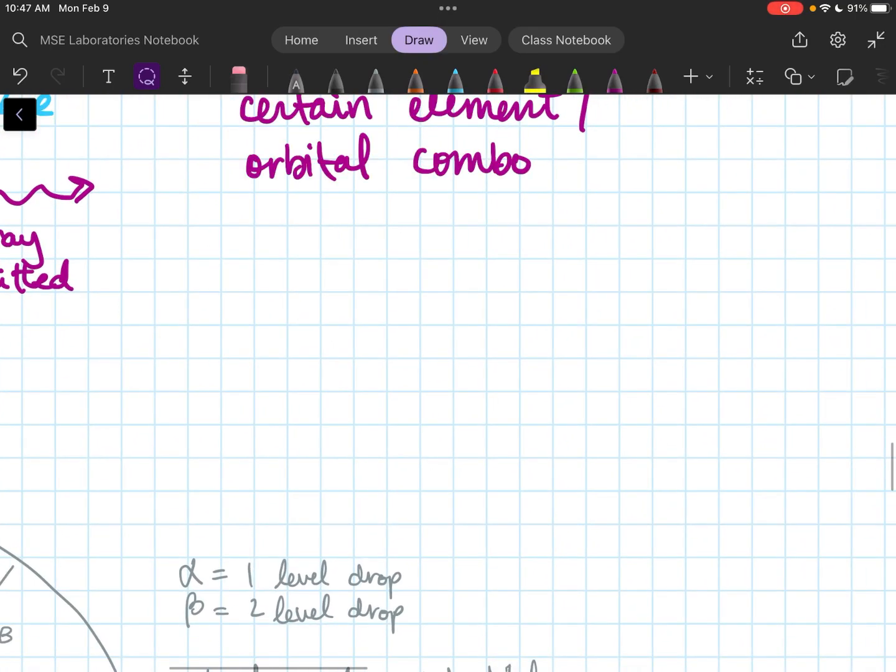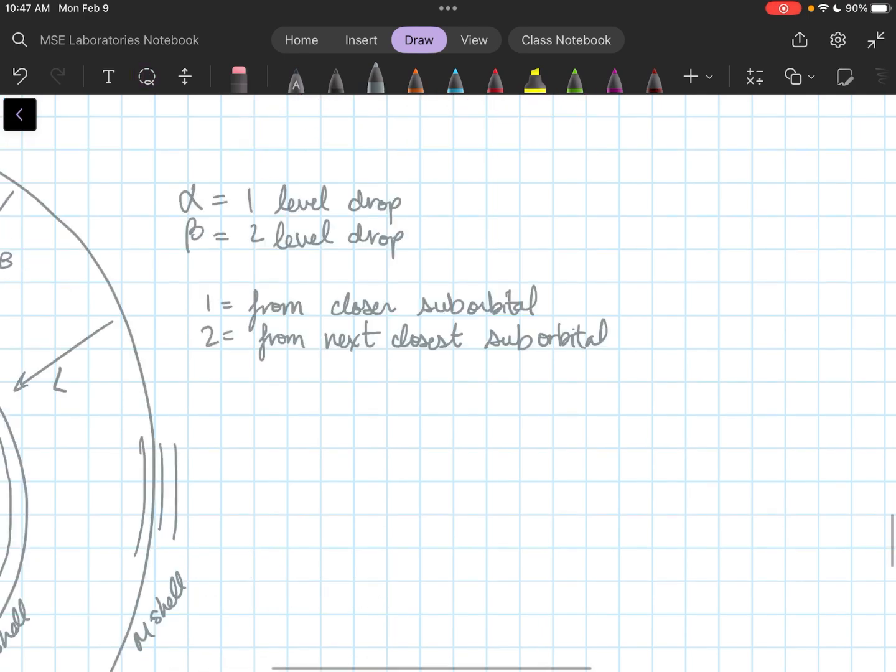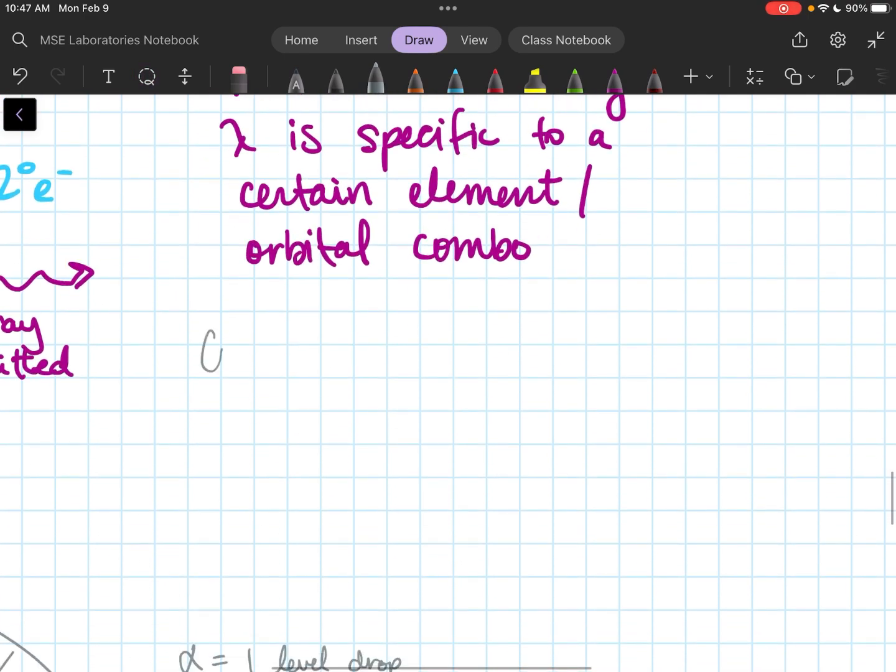As an example, copper K alpha is 1.5406 angstroms for its wavelength. If you see a wavelength that is 1.5406 angstrom, and that is an X-ray, that comes from copper K alpha. There's no one else that makes that exact wavelength.